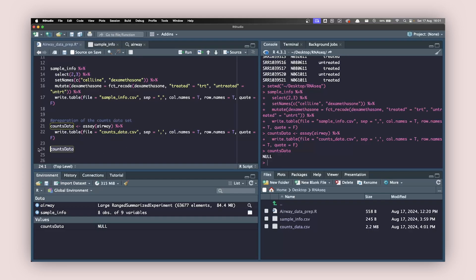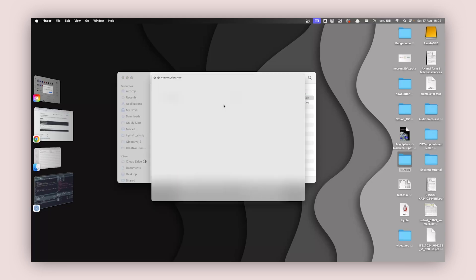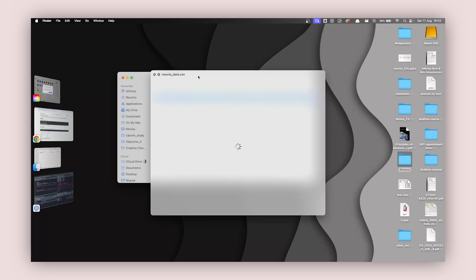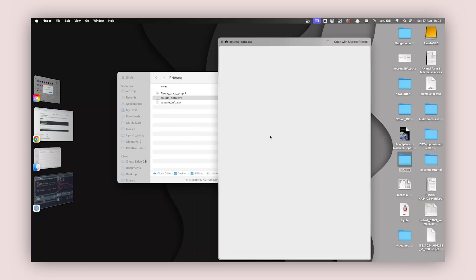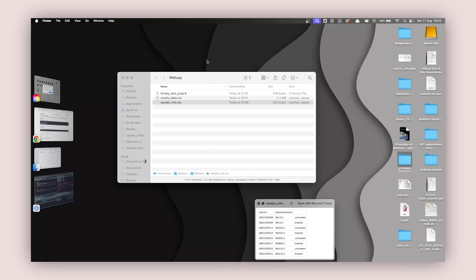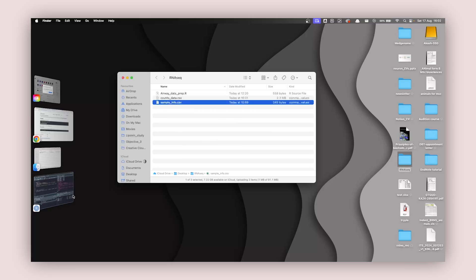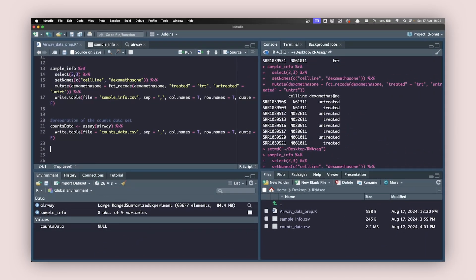Select all of this and hit Command+Enter, and you'll get another file — counts_data. You can go to the Files panel to see both: the counts_data file with the read counts, and the sample_info file. Don't worry if the column headers in the CSV appear slightly shifted — when we pull it back into R, it's going to be properly aligned.